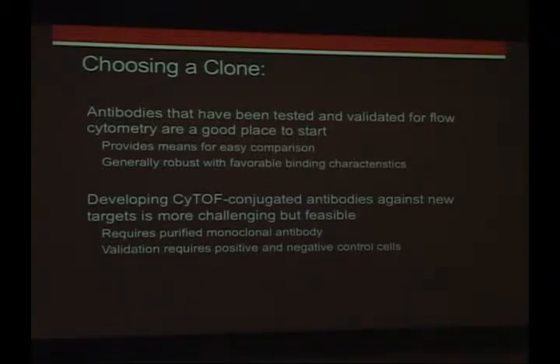On the other hand, if you're interested in a protein to which there's not a great commercially available fluorescently labeled antibody, it's still very possible to develop CyTOF labeled reagents. It does require a purified antibody. I say here monoclonal is preferable, but you can also use purified polys. It does need to be purified. I'll mention why in a little bit. And the validation for that is obviously a little trickier. It really requires having a good positive and negative control population of cells, as you can imagine. Sometimes that's a little bit trickier depending on exactly what protein you're trying to measure.